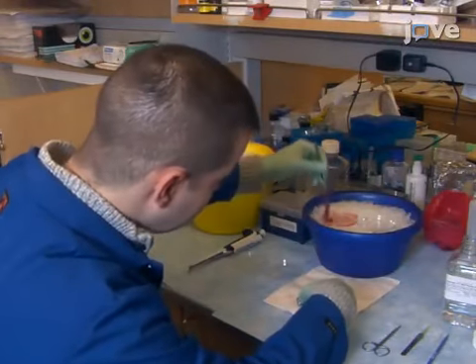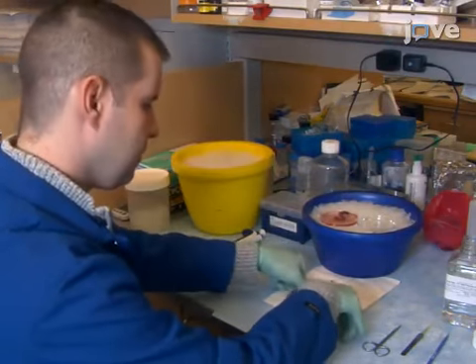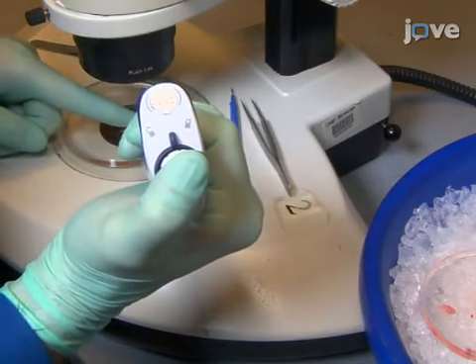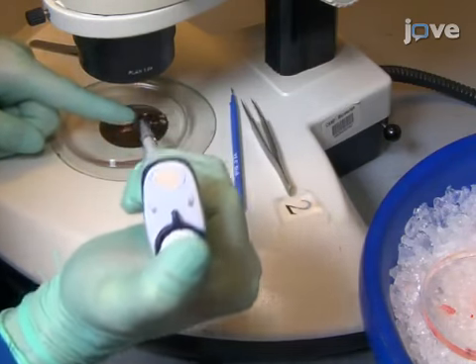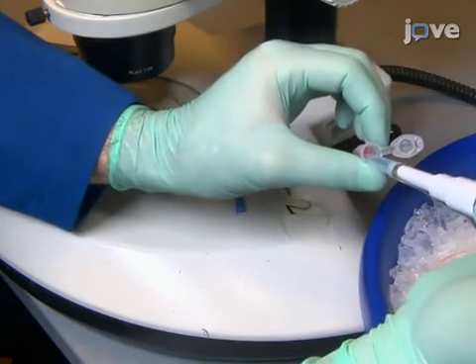After preparing lentivirus and dissecting the MGE according to the directions in the written protocol, collect both hemispheres of the MGE and put the tissue into two 1.5 milliliter collection tubes containing 500 microliters of DMEM with 10% FBS. Keep the samples on ice.